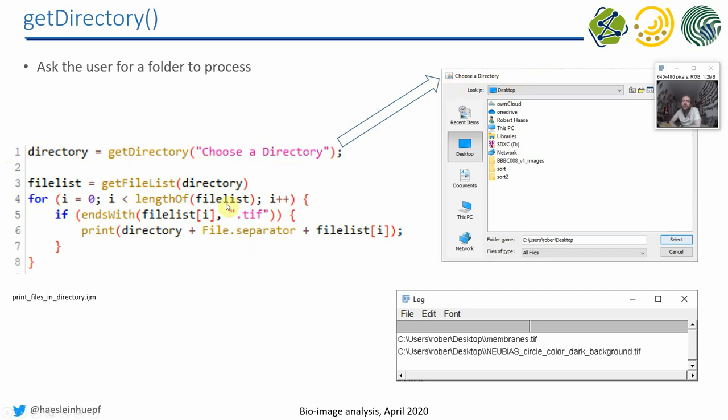And after executing this program, so it asks for a directory, and then it will go through this directory and print out all files which end with TIFF. And then you can, for example, see what TIFF files I have on my desktop.